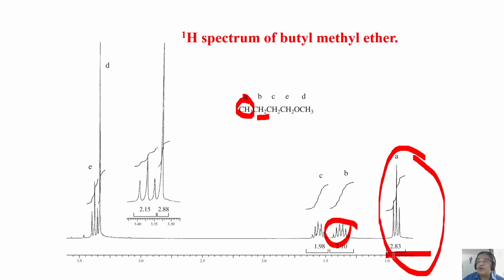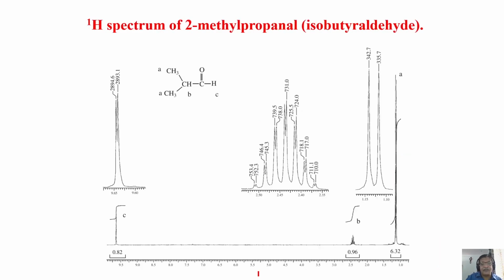Now I'm sure you would have got a hang of how to go ahead in analyzing a spectrum when the molecular formula is given, or when the structure is given. You can think of both. You may be given a molecular formula without knowing the structure, but you have to get the structure. That is possible, because when you synthesize a molecule, you do not know what it is. Or you may know the molecule, but you do not know the structure. Either way, you can get the information by analysis of the spectrum. So we can continue like this further.